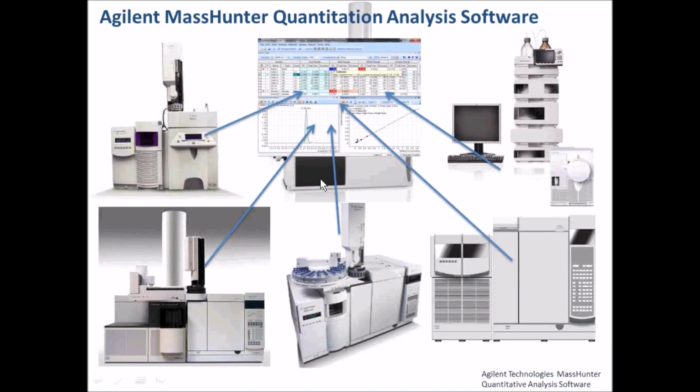To the triggered MRM feature, which is available on the LC Triple. The triggered MRM feature acquires dynamically additional secondary transitions, which can be useful.